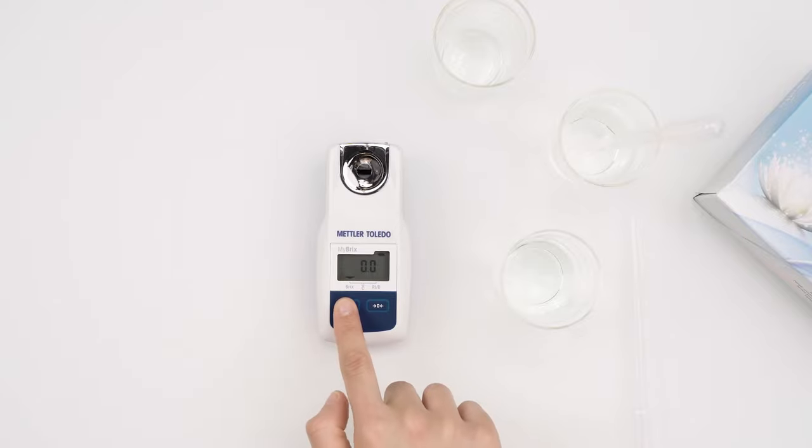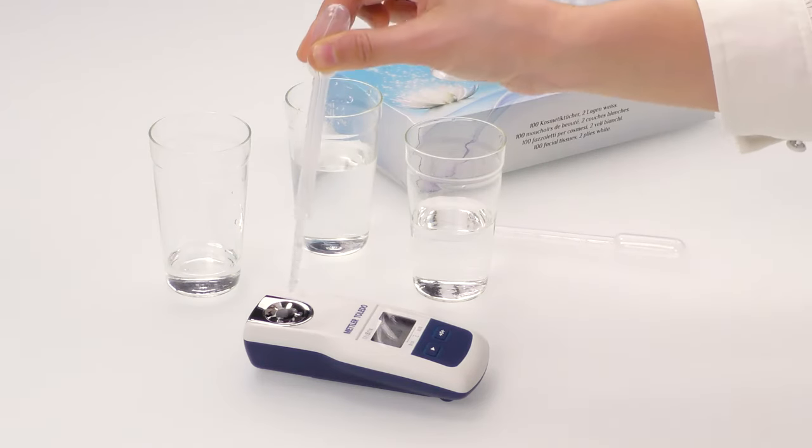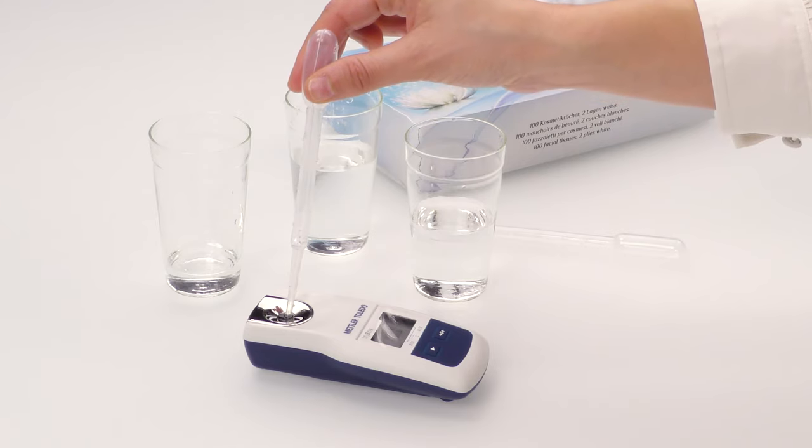Press the READ key to measure. The results must be within the instrument accuracy of plus or minus 0.2% Brix. Remove the sample and dispose it in the waste beaker.